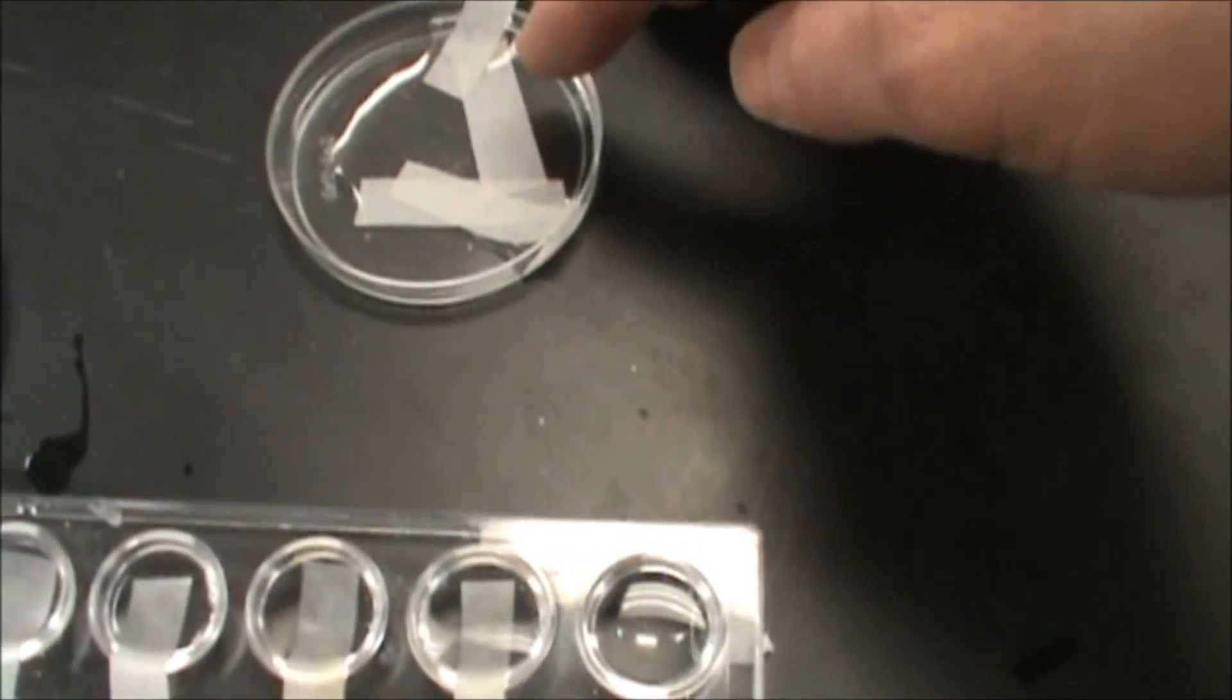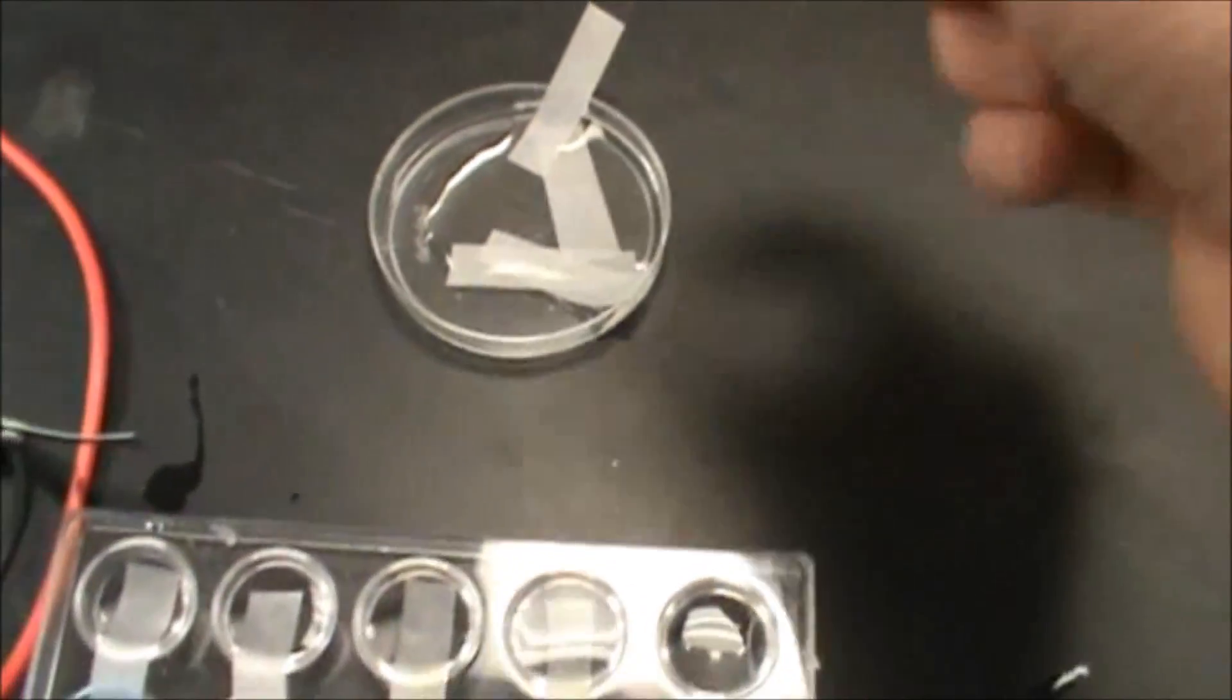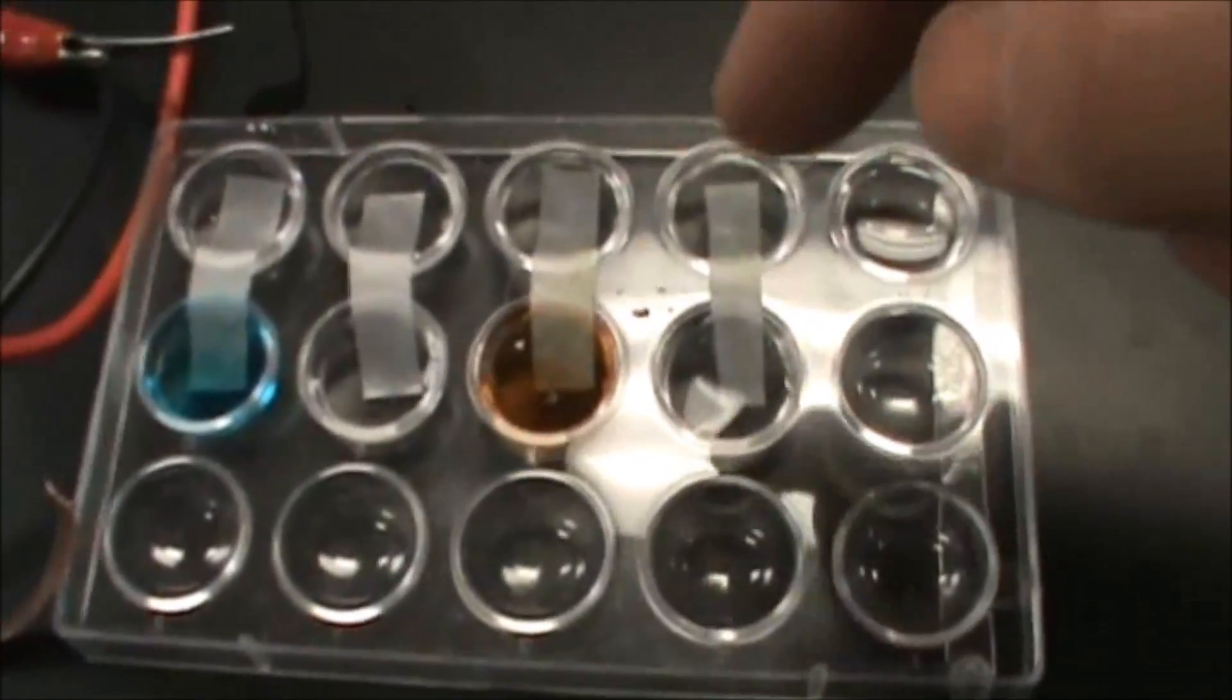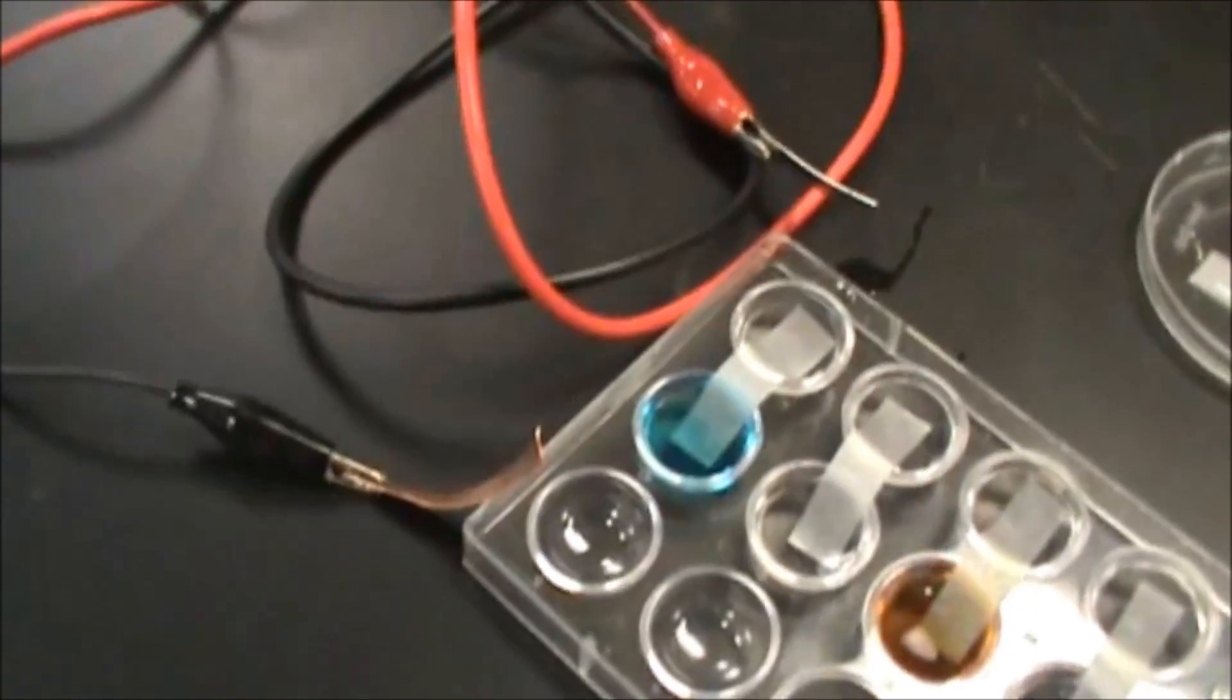In here we have some potassium nitrate solution that's soaking into some chromatography paper, and those are serving as our salt bridge between the two. And then over here we have our voltmeter, and the voltmeter will hook up to the various leads.